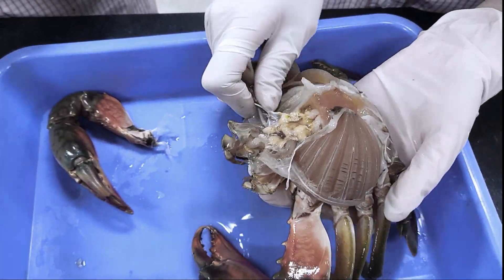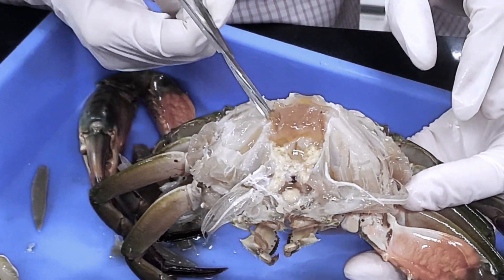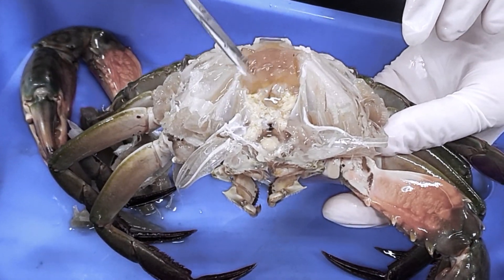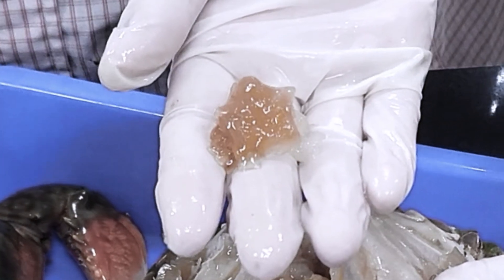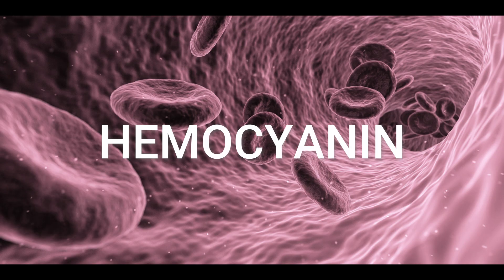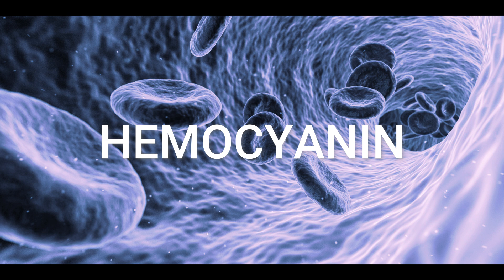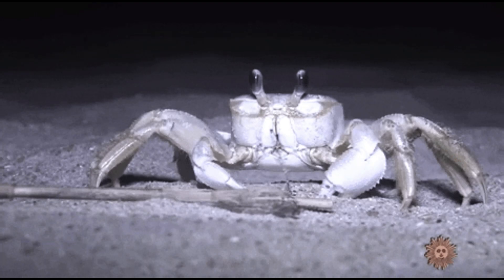Removing the gills, you can see its exoskeleton. Lastly, the jelly-looking core is its heart. The heart is suspended by a network of elastic suspensory ligaments that connect to the surrounding tissues. Its blood contains hemocyanin, which is a respiratory pigment that turns pale blue when oxygenated and colorless when deoxygenated. This is the end of the Scylla olivacea dissection.